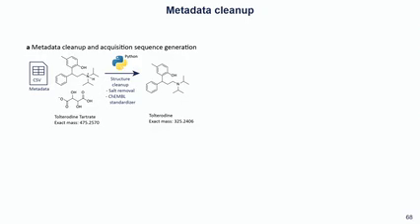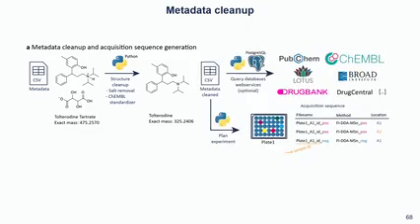And this cleaning and structure standardization is done in a Python script. Then we also have the option to add additional information if you're interested in drugs, so you want to know in which clinical phase it is, or if it was found in any plant or microbe already, so we also have the option to query LOTUS in this setup or in this Python script.